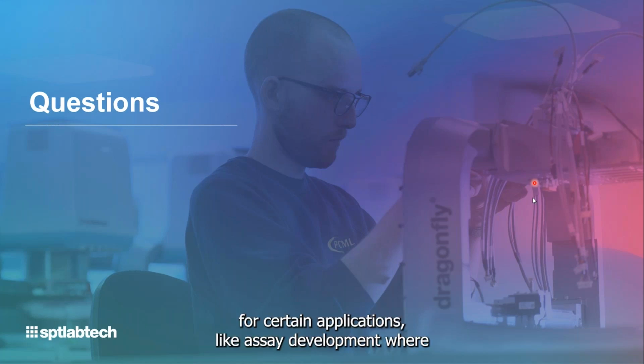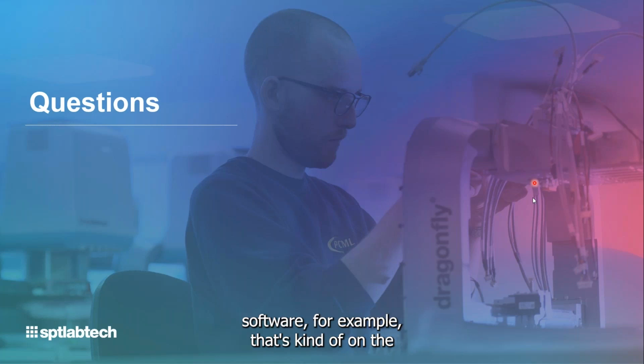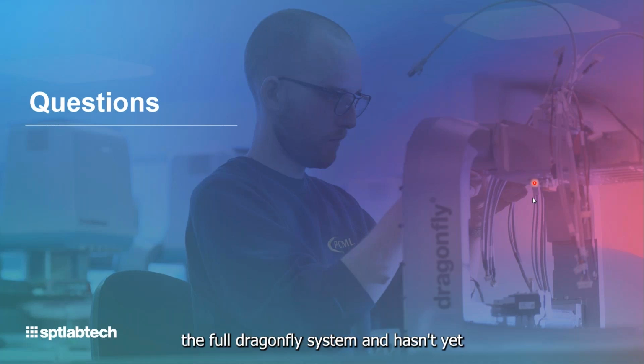I say most of, because for certain applications like assay development, where there is some quite complex interfacing with design of experiment software, that's on the full Dragonfly system and hasn't yet been incorporated into Firefly.